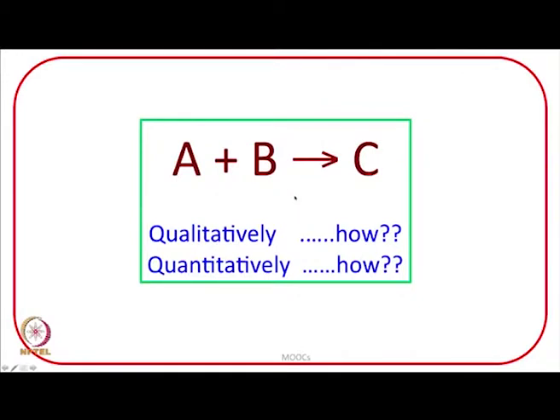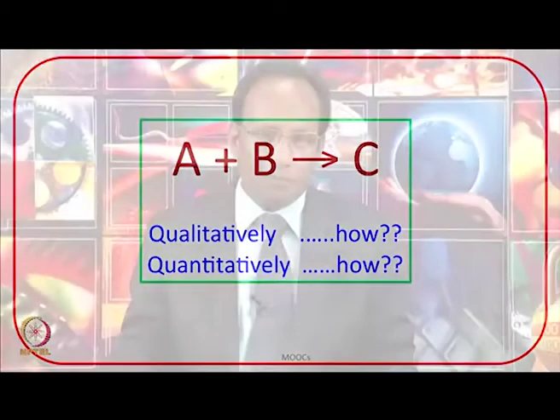If I know the equilibrium constant, I can immediately get the change in standard Gibbs free energy. And if I know the heat and delta G naught, I can calculate delta S naught. That means by making it quantitative, I am talking about establishing the stoichiometry of the reaction, establishing the value of the equilibrium constant, determining or measuring the heats of interactions, and the entropy change. Once I have all these thermodynamic quantities, I can describe the process both qualitatively and quantitatively.